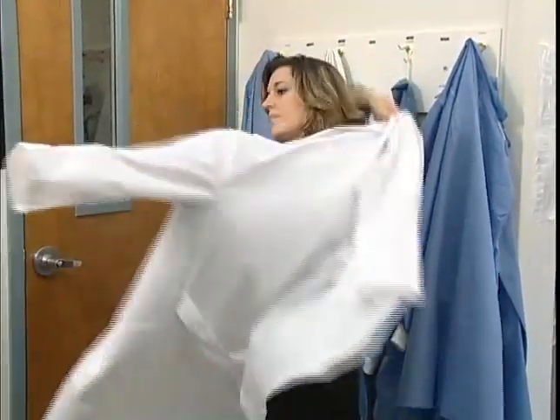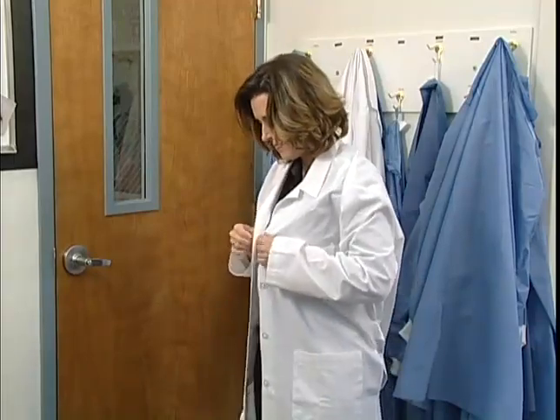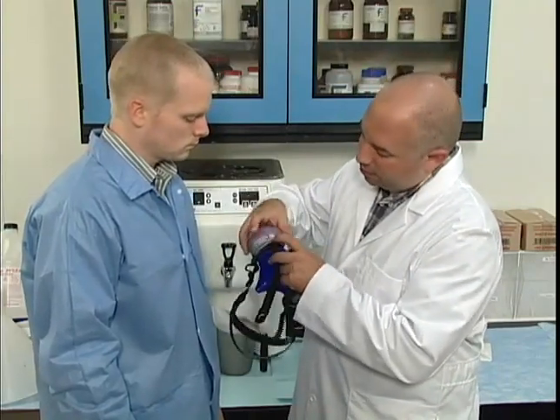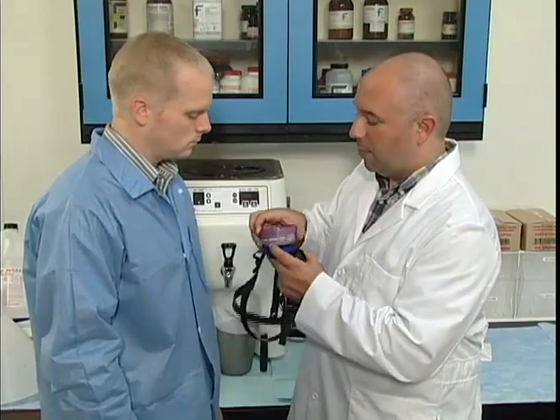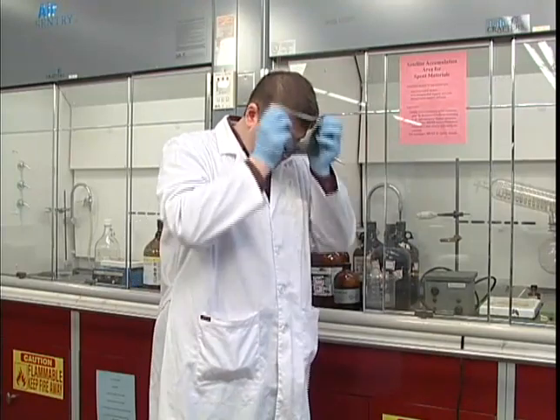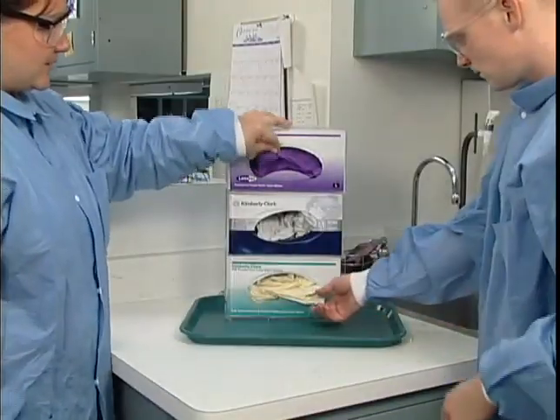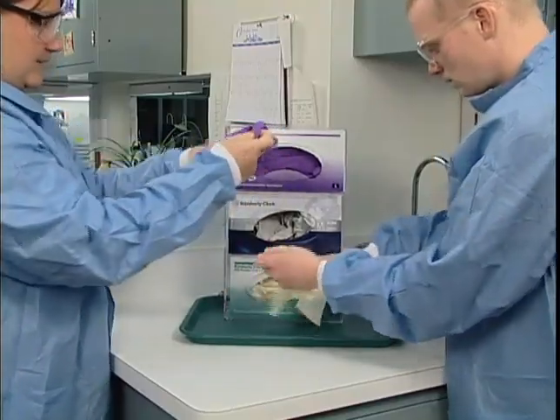This section also lists the personal protective equipment necessary to minimize the risk of exposure. For example, to provide respiratory protection, the SDS may instruct you to wear a NIOSH-approved air purifying respirator equipped with organic vapor cartridges or canisters. For eye protection, you may be directed to wear safety glasses with side shields or safety goggles. To defend against skin contact, rubber gloves and other protective clothing might be recommended.